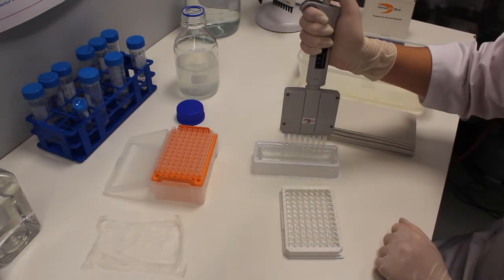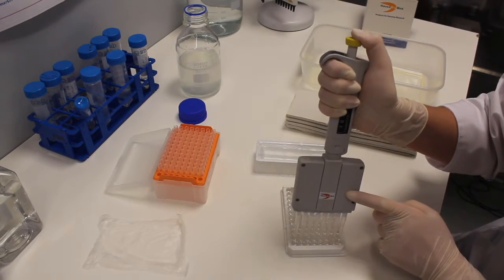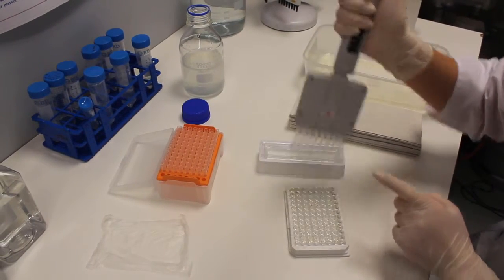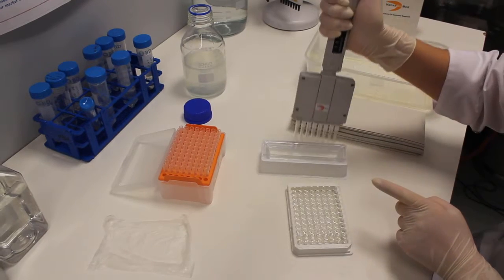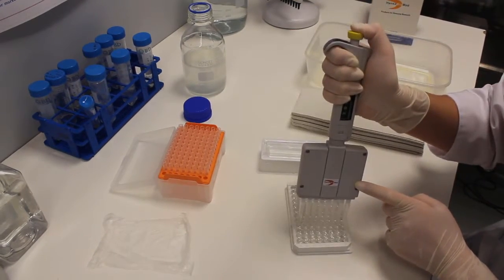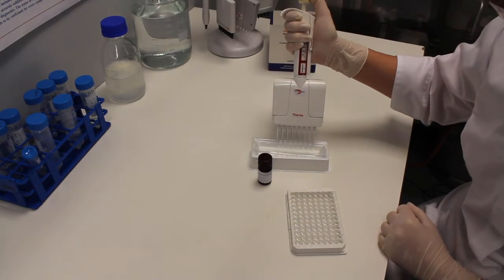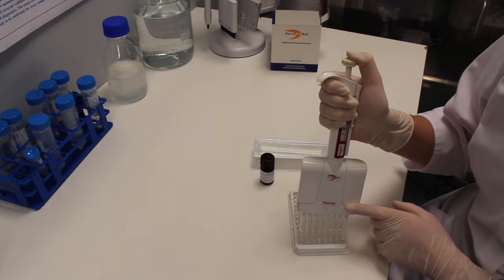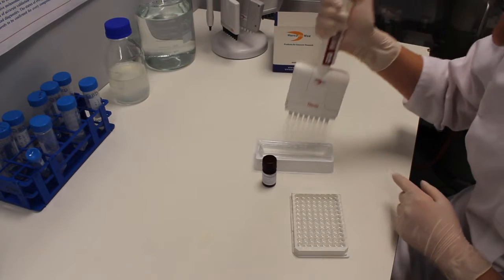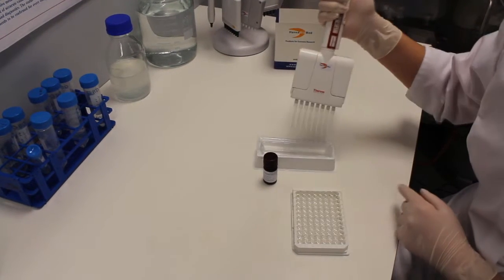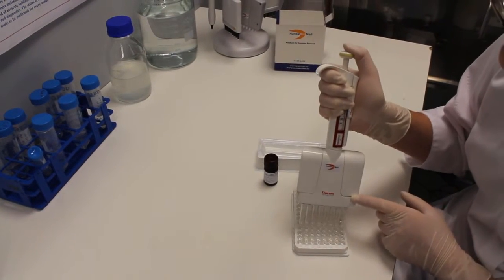Wash the plate with washing buffer as described in Step C. Add substrate solution, 100 microliters per well, and incubate in the dark for 5-10 minutes until blue color is visible.